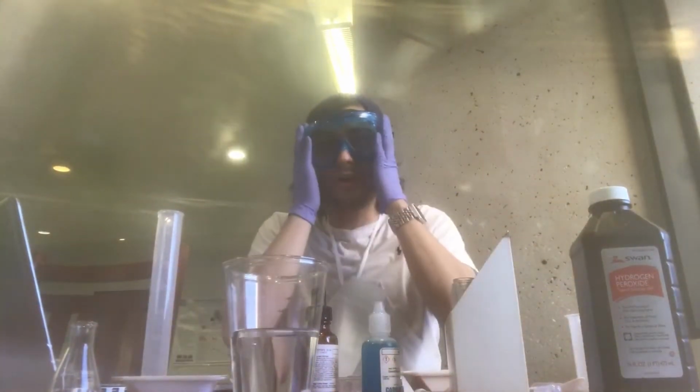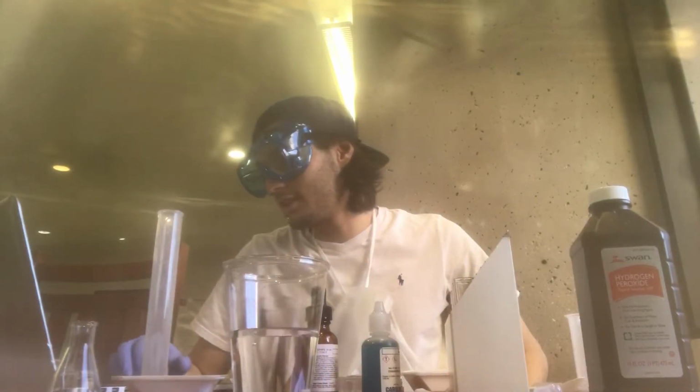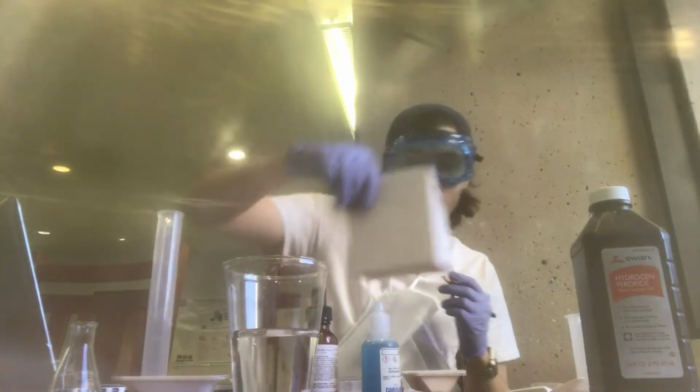I also have my goggles, my gloves, and my apron on, because safety is always the most important thing. You don't want to hurt yourself with these chemicals because they can be dangerous. Okay, so let's start out with the grease pencil. We're going to number test tubes 1 through 5.